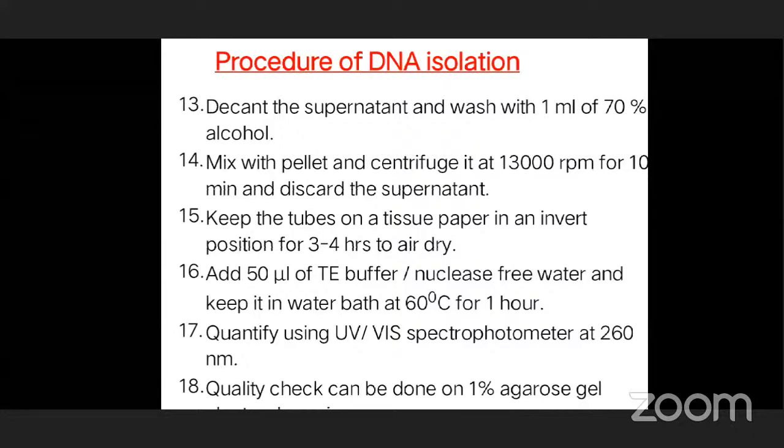This is required for dissolving the DNA. Quantify using an ultraviolet spectrophotometer at 260 nanometers.